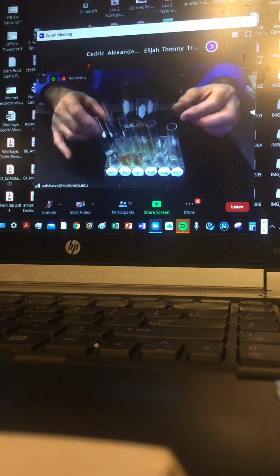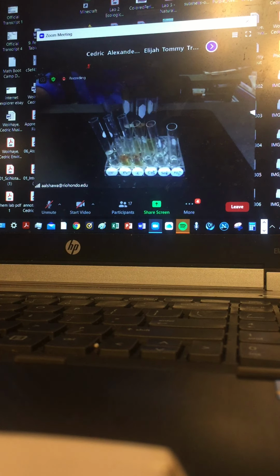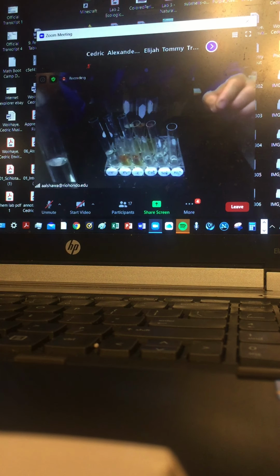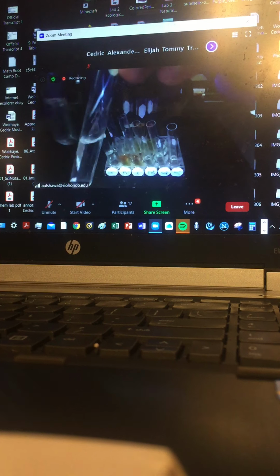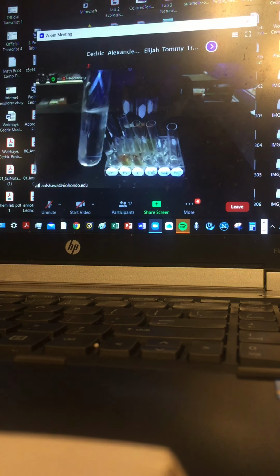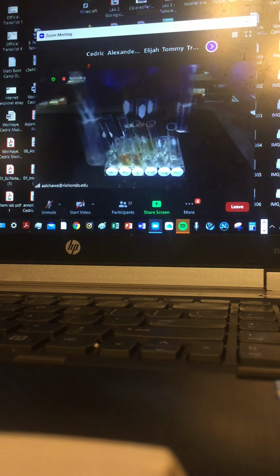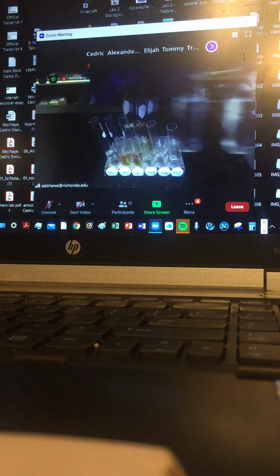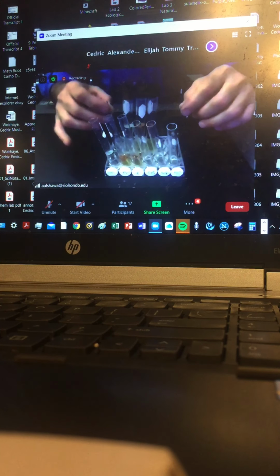Now I want to check unknown 2 for the same thing, which is the hexane organic. So if you drop some hexane, here is unknown 2. So this is unknown 2, and this is unknown 1. They both are clear. Okay, so this is unknown 1, and this is unknown 2. Unknown 1 and 2 together, no difference. They remain clear. Okay, so negative.